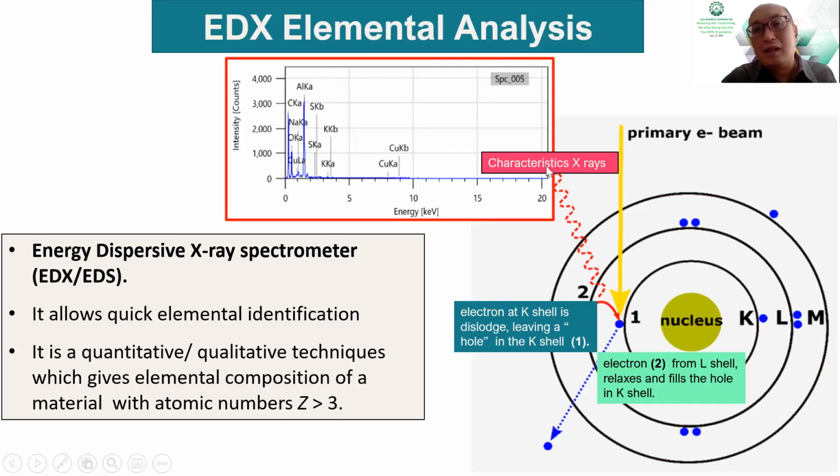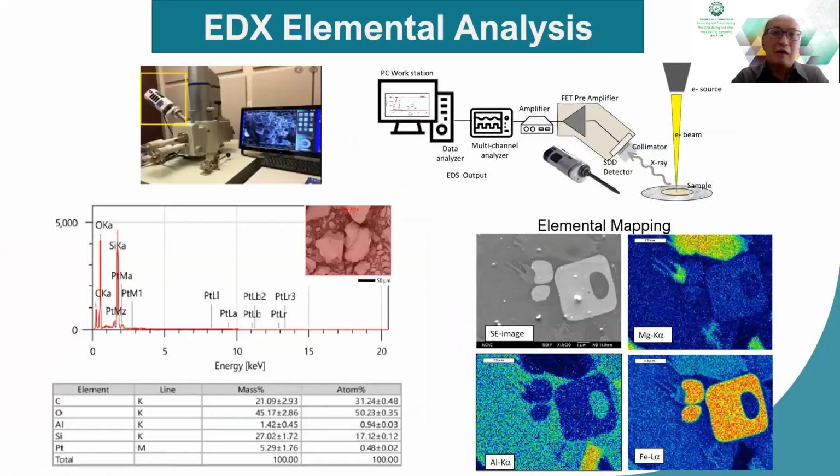This relaxation results in characteristic X-rays, which show the elements of this material. So that's how EDS or EDX works.